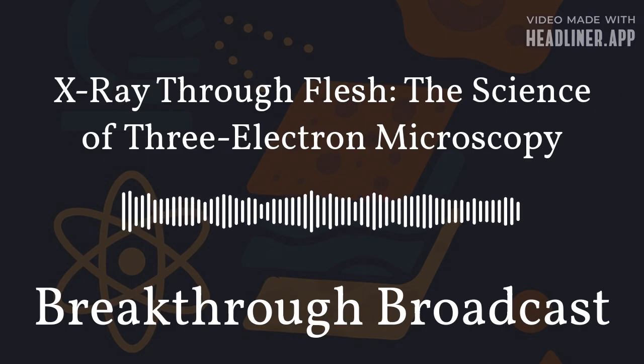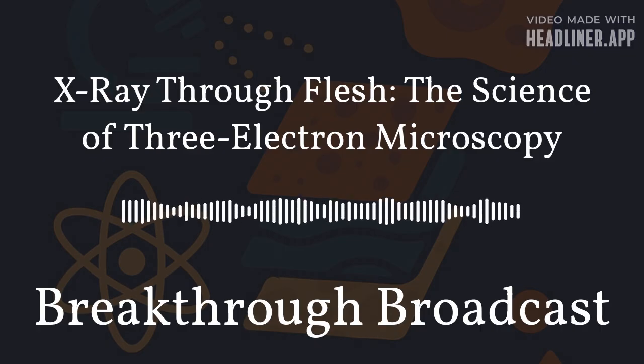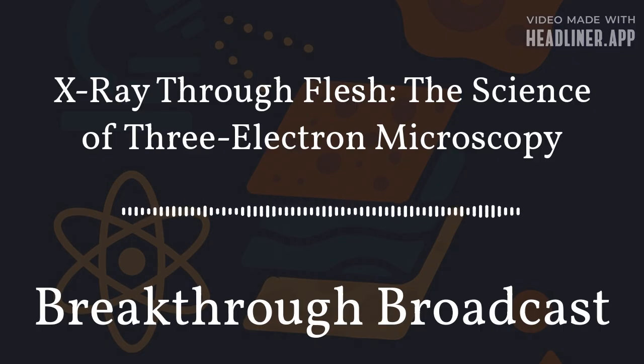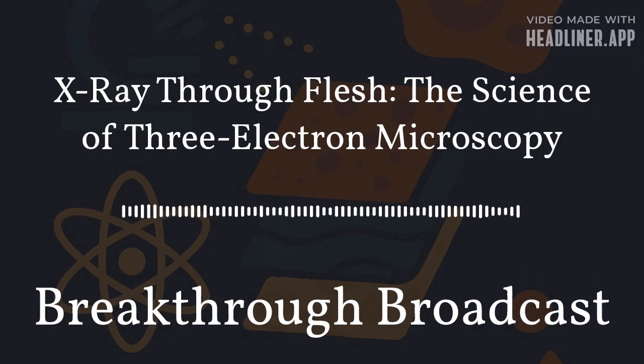Outer electrons are loosely held, so they're easily displaced and become the secondary electrons that show details. Beam electrons that interact with the nuclei are more likely to scatter backward, creating backscattered electrons. If the material is thin or lightly structured, a portion of the beam passes through, producing transmitted electrons. These different interactions occur naturally in all electron microscopes. The Three-EM technology leverages them deliberately and simultaneously to extract a wider range of information from the same sample.